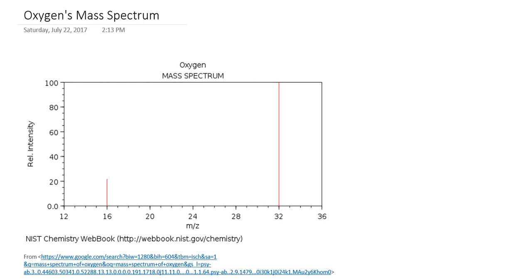If you notice, once again, on the x-axis here, this is mass to charge ratio. So basically the mass of the particle that we're analyzing divided by the charge of the ion that we created when we volatilized and ionized the sample. Now, more often than not, the charge on those ions is usually +1 if we have mass spectrometry being carried out in the positive ion mode, though that can vary, and I'll show you in the next slide how that can vary.